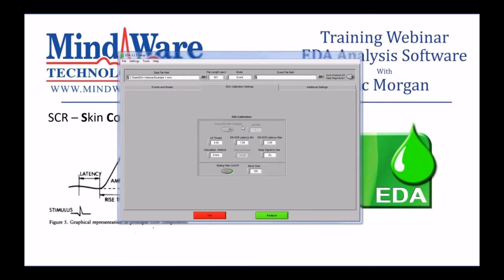And if you're using something like an acknowledge file or some other third-party file that you imported into MindWare, we might not know that information at all, and you would have to tell the application. So in that case, you would then enter your own scaling factor of how to get your data from volts to the microsiemen value.